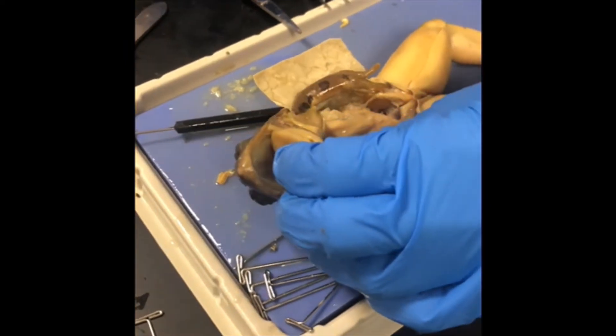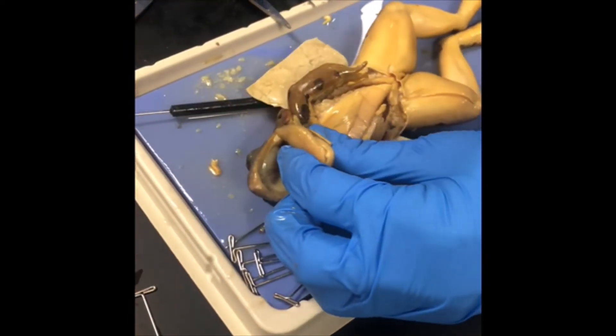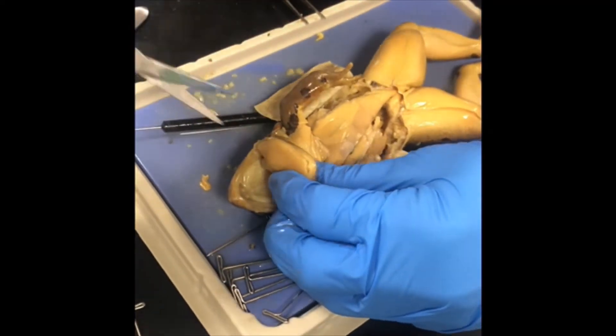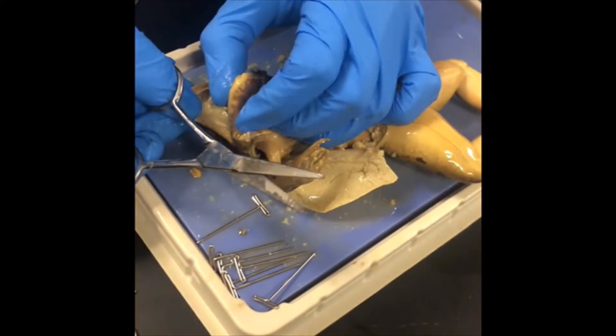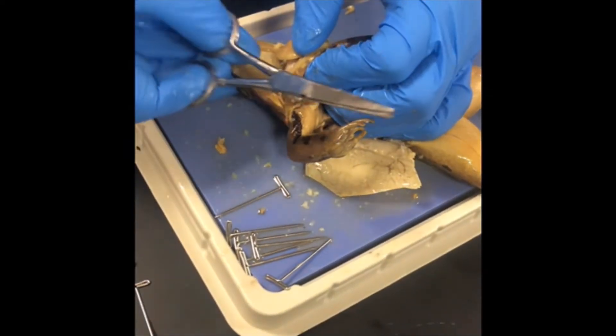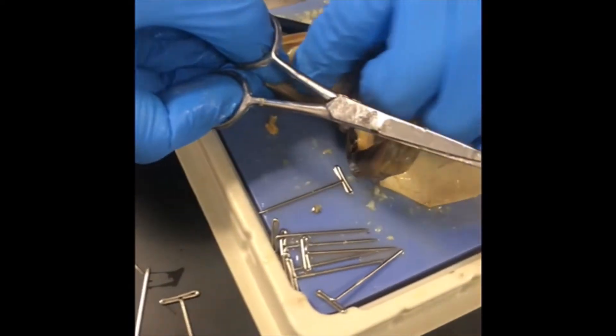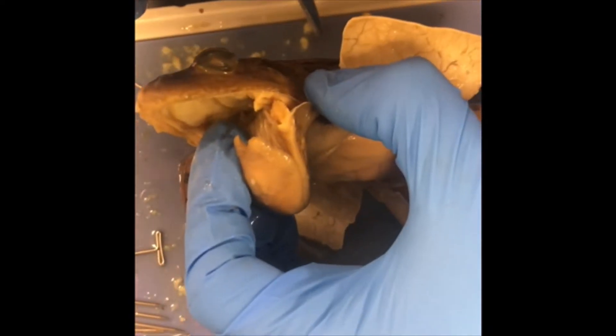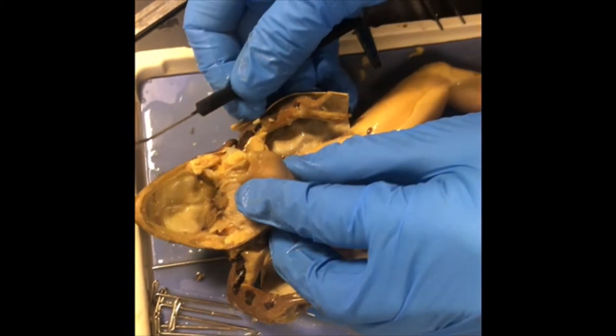Open your frog's mouth very wide. Cut the corners of the jaw so it opens wide — cutting right at the corner of the jaw. Now we can actually open it up. Insert a probe into the glottis and observe its passage into the trachea.